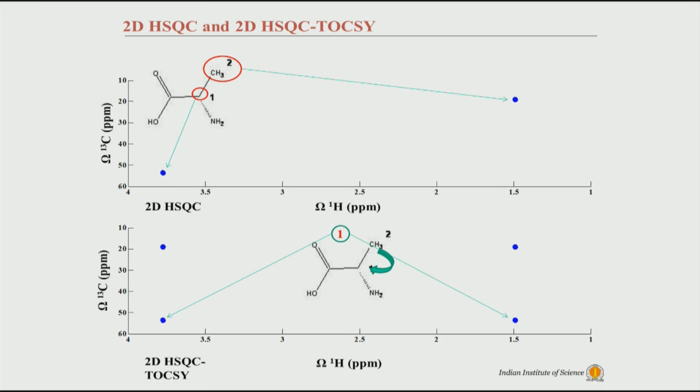Okay. So, this is typically a situation in some areas in NMR known as metabolomics, where you are looking at small molecules in a system, and what happens is many molecules will be mixed together in the same sample.